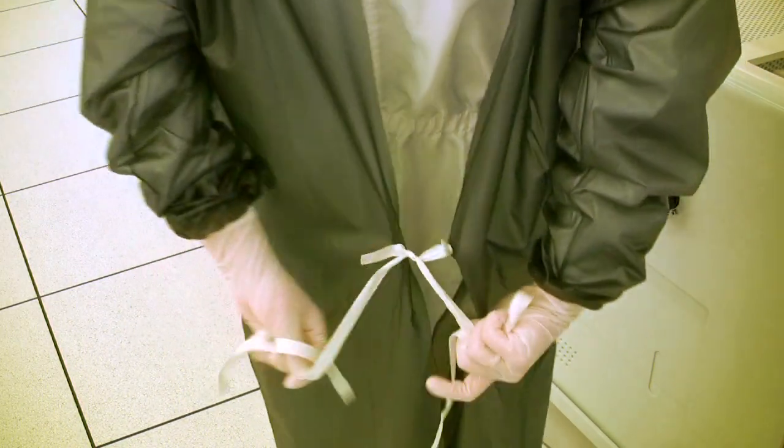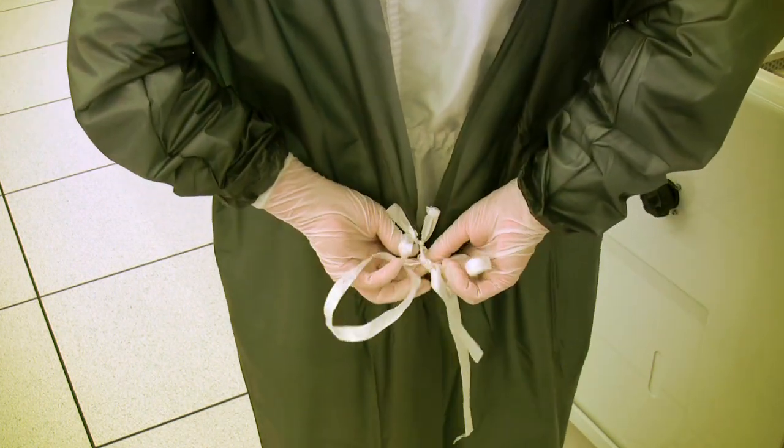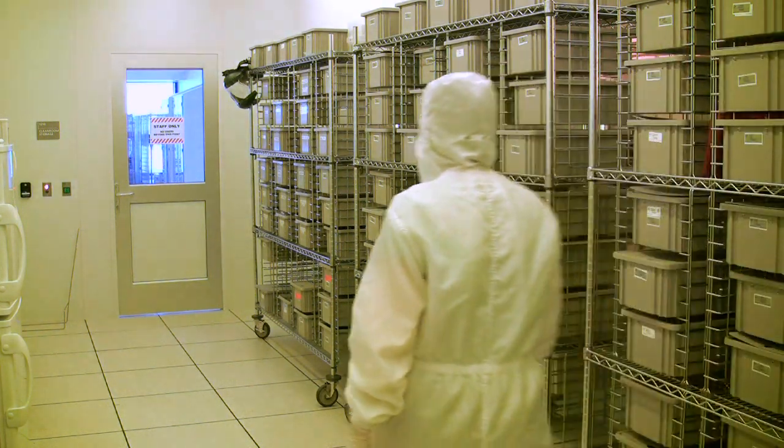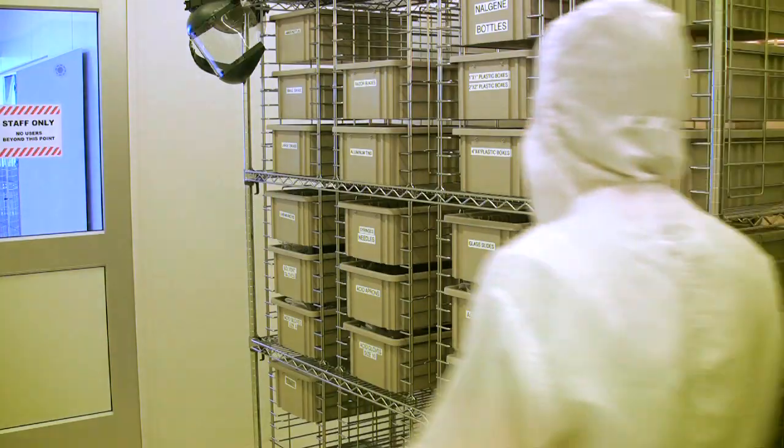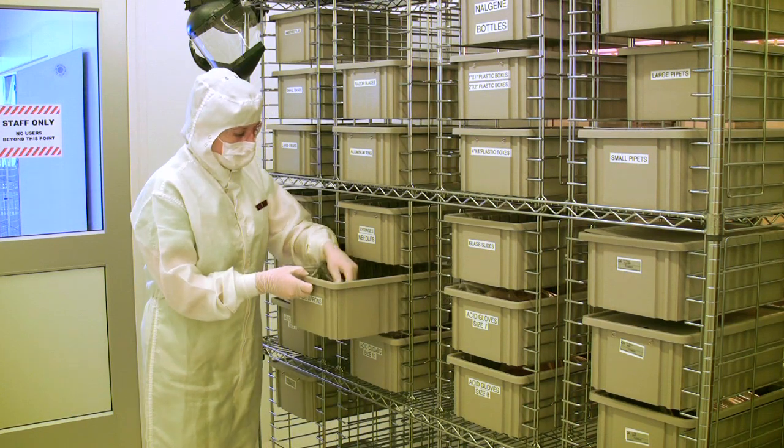The idea is to keep any chemicals that you might spill on the front of the apron off of the tie, which at some point might be touched by an ungloved hand. If at any time you feel that an apron is unsafe from being damaged or from chemical contamination, feel free to grab a new one from the cleanroom supply storage area.